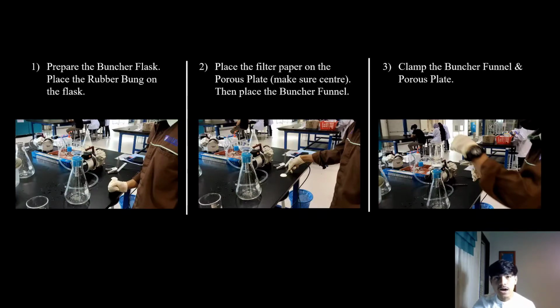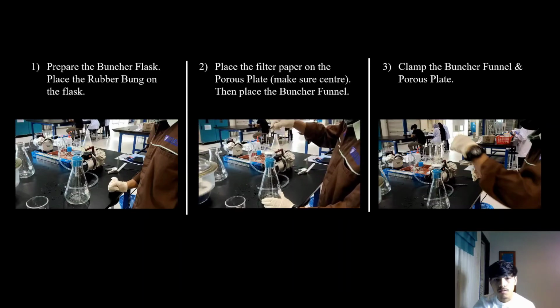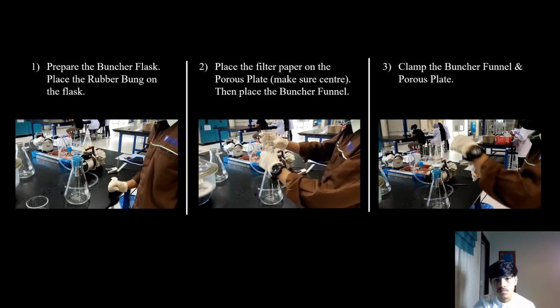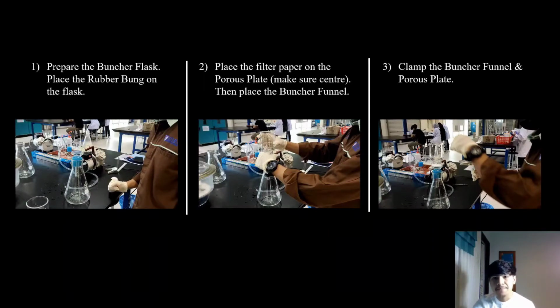Second, place the filter paper on the porous plate. Make sure it is centered. Then, place the Buchner funnel. Step 3. Clamp the Buchner funnel and porous plate.